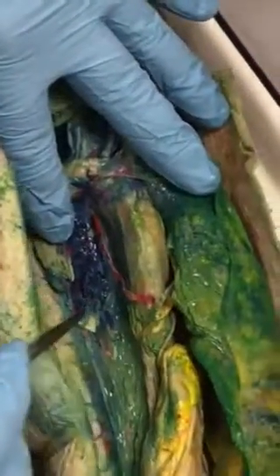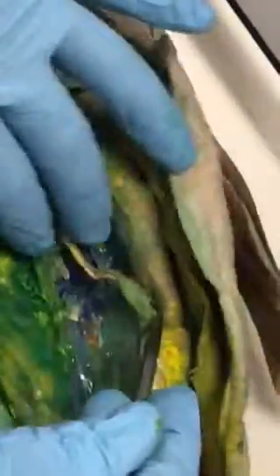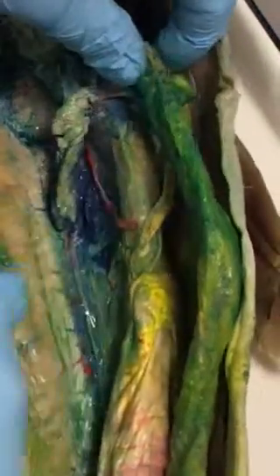Celiac artery. The celiac, that is on mine. It got a little bit cut, but it's this bright red one here. Okay, that's easier. Which one's that? That's the celiac. It goes along the stomach, going into that, that's the stomach right there. Yes, this is the stomach right here. They've got a long stomach. Mine got a little bit cut, so theirs could be in a different location than mine, but it's this bright red guy that's kind of floppy.